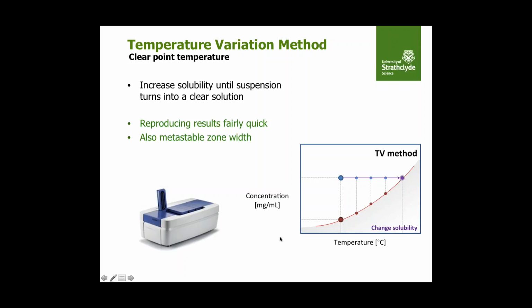And that would be at the purple point in the graph. So it is quite a quick method where you would be able to obtain a full solubility line in about a day. And as a bonus, you would get information on the metastable zone.